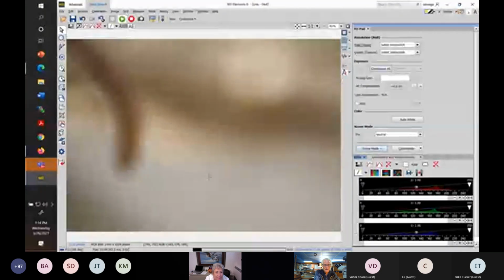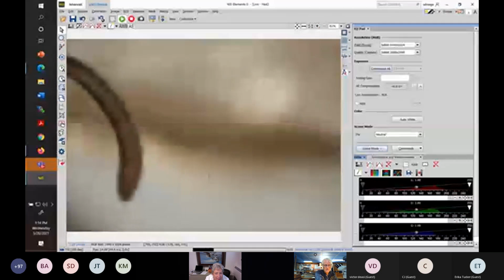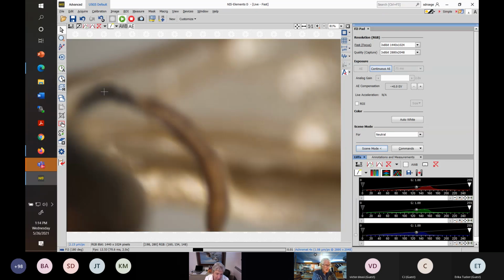So it's more difficult when we're looking on the microscope. And I'm spending time here because people do have to spend a fair amount of time. So here's the last flagellar segments. There's one. It's barely in focus there. You can see the line, the suture line, that's separating the segments out, and you would just count those. And you would come up with the notion that this specimen has 12 antennal segments, and the 12 number includes the scape and the pedicel, and that would make it a female.